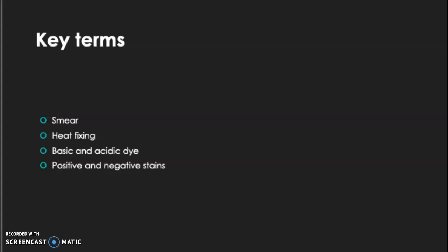Positive and negative stains. Dyes are selected for staining based on the chemical properties of the dye and the specimen being observed. A positive stain is a dye that is absorbed by the cells or organism being observed, adding color to objects of interest to make them stand out against the background. A negative stain is absorbed by the background, but not by the cells or organisms. Negative staining procedures produce an outline or a silhouette of the organism against a colorful background.